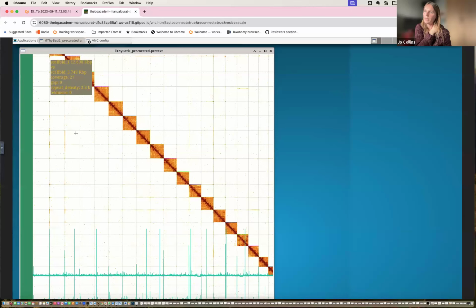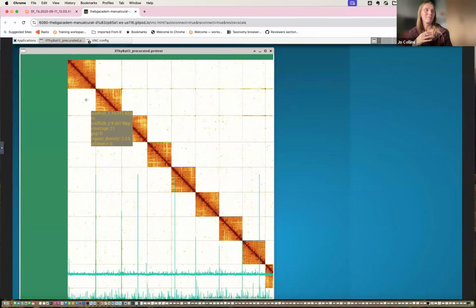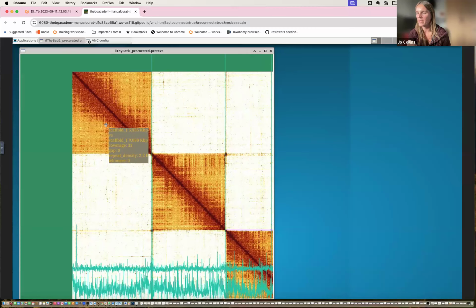come back to our Pretext, and we can label up our Z chromosome.